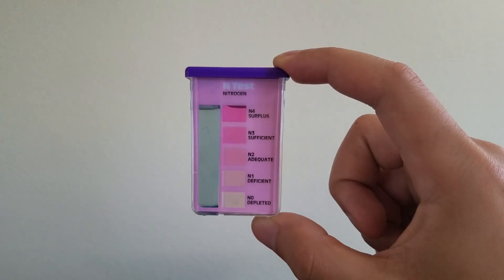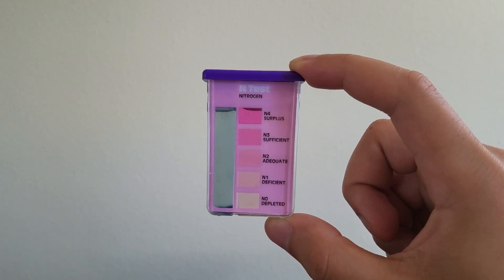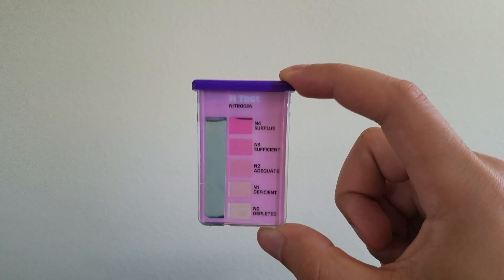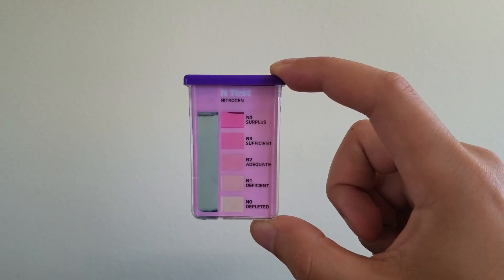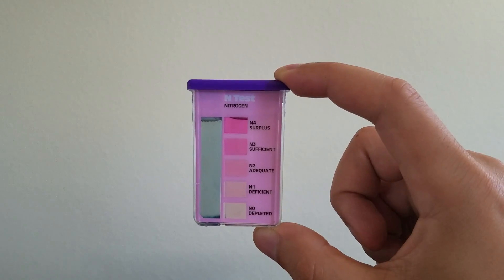They've settled and it's time to analyze the results. Starting with nitrogen — it's looking somewhere between sufficient and surplus, although I'd be skeptical about it having a nitrogen surplus in my yard. I'm going to do a couple more tests off camera, but my official call is somewhere between sufficient and surplus. My gut says it's actually somewhere between adequate and sufficient.